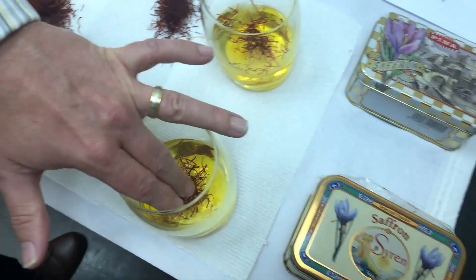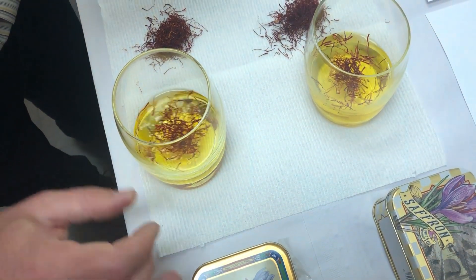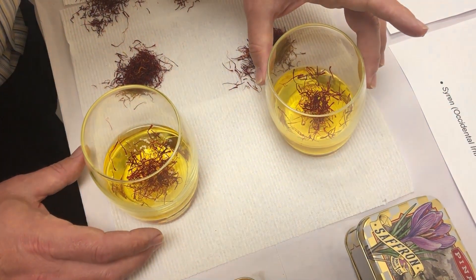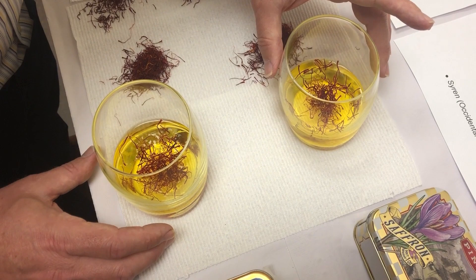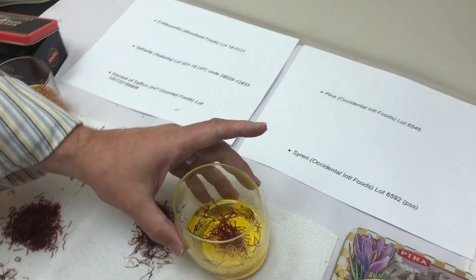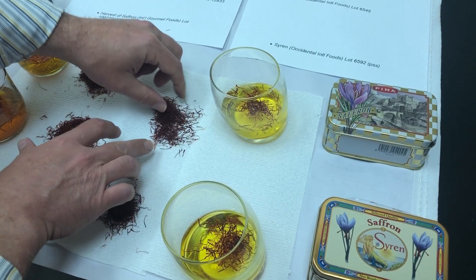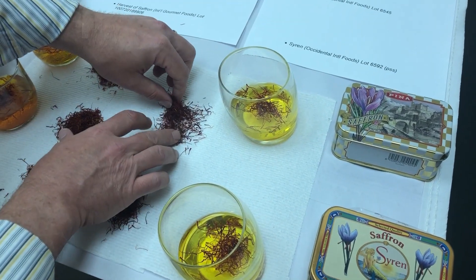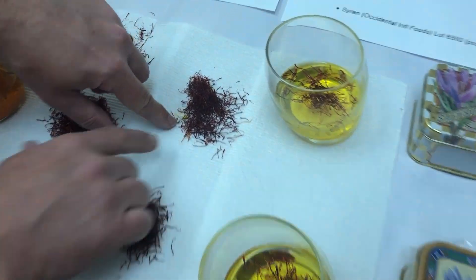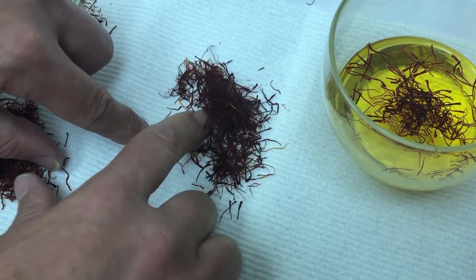Compare that to ours: the Occidental Foods lots from both Syren and Pina. The Pina we already tested before — we estimated about 97–98% of the threads are stigmata. The remaining small percentage are stamens and styles, which is acceptable. It is acceptable to have a small percentage of stamens and styles as long as they are not artificially colored. When the stigmata and a small percentage of stamens and styles are together and pure, you'll see a very small percentage of yellow to off-white threads in the dry state.